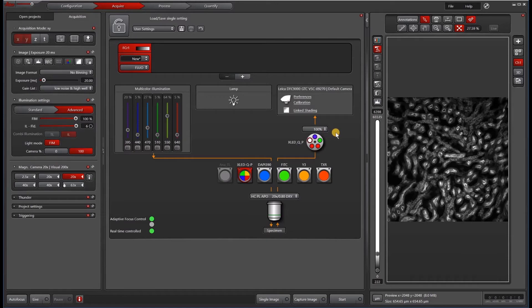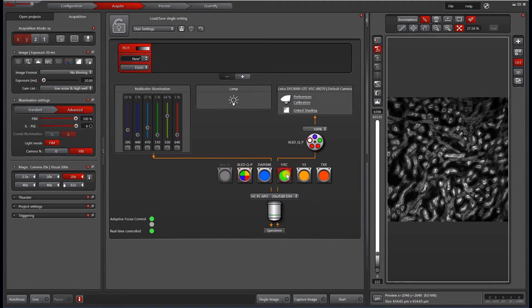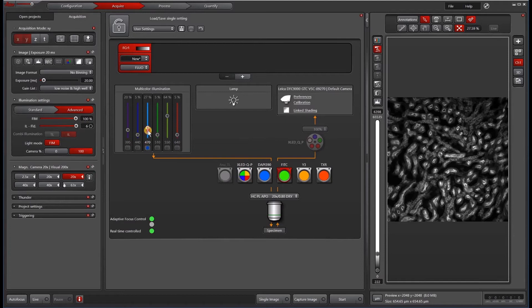But first, let's say we want to set up a more traditional single bandpass filter for the green channel. So I will select the FITC cube, then I will select my 470 line. And again, I can increase or decrease this intensity.